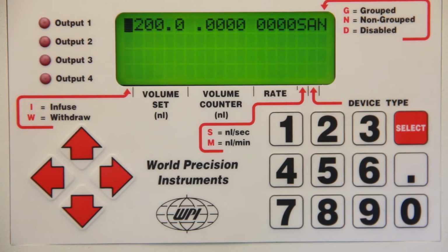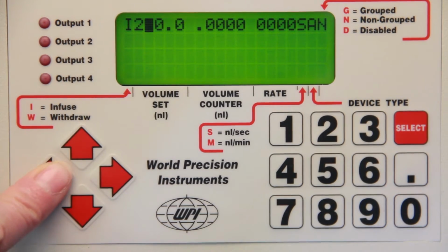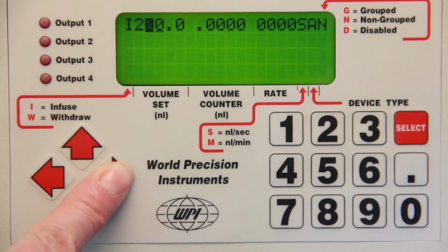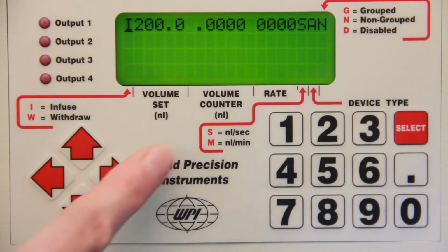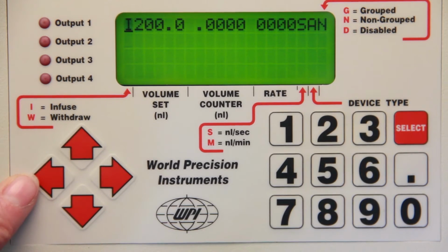A few hidden functions are accessible when the cursor is in this field. Pressing the number 1 button disables audible tones on all channels. Pressing the number 2 button enables them. This is the default setting. For now, let's turn off the tones.